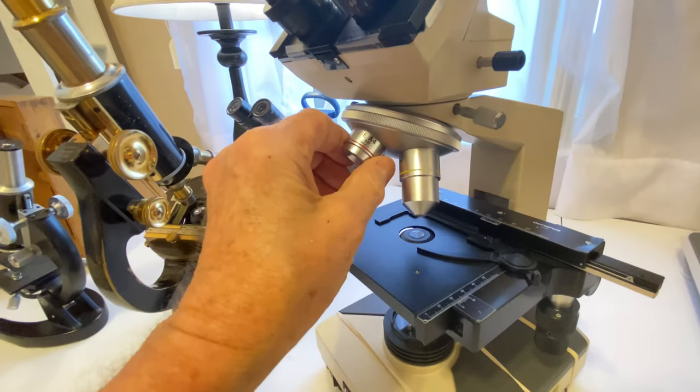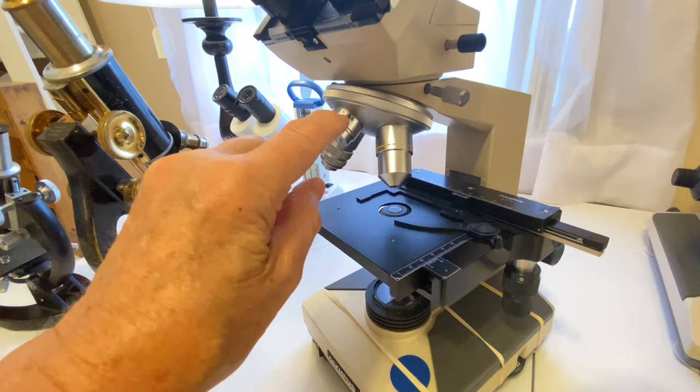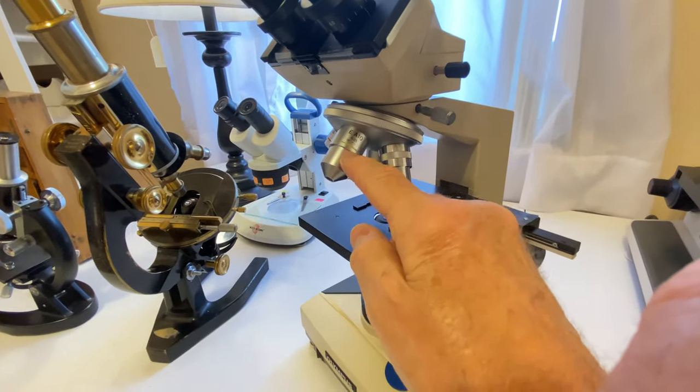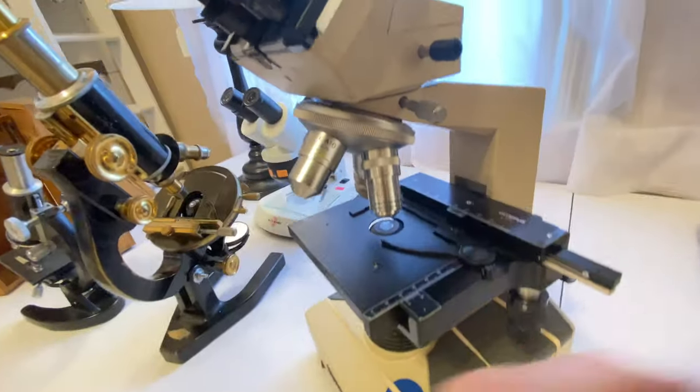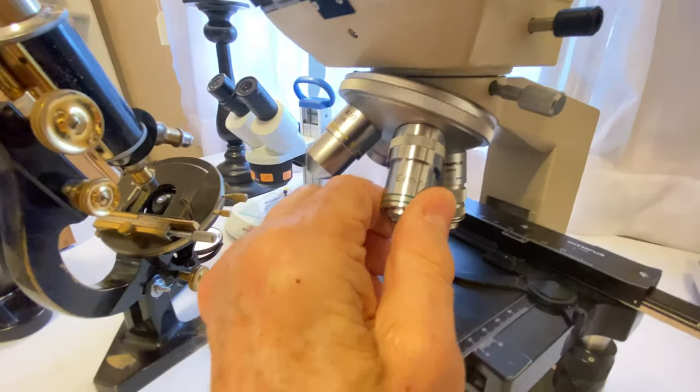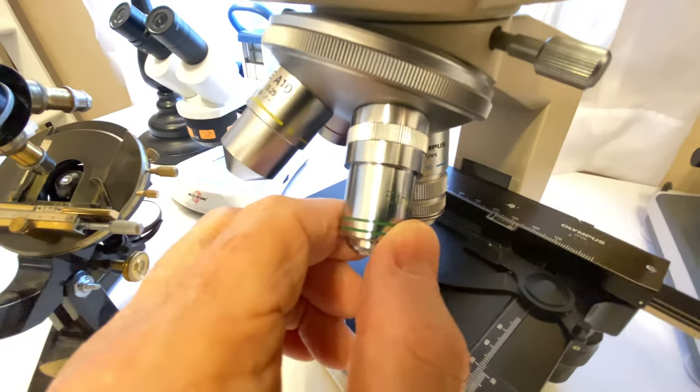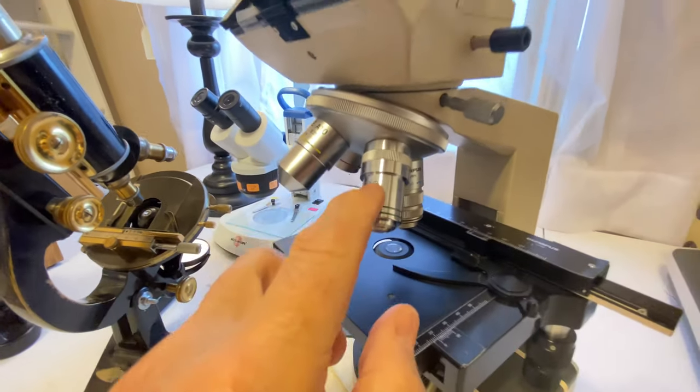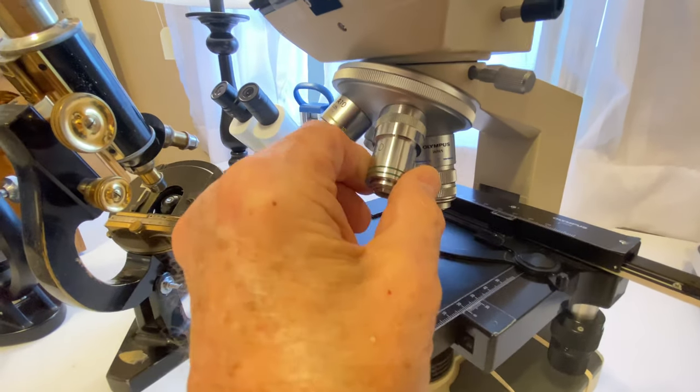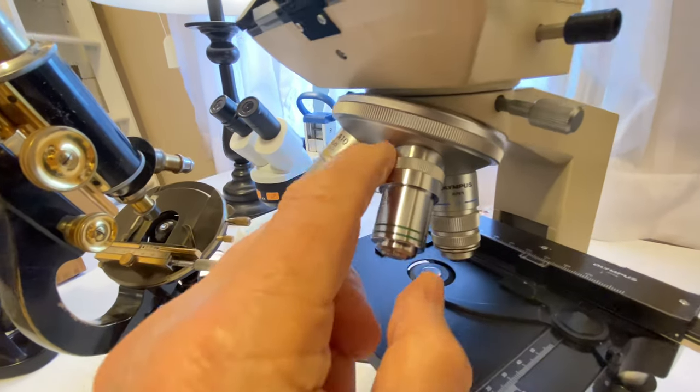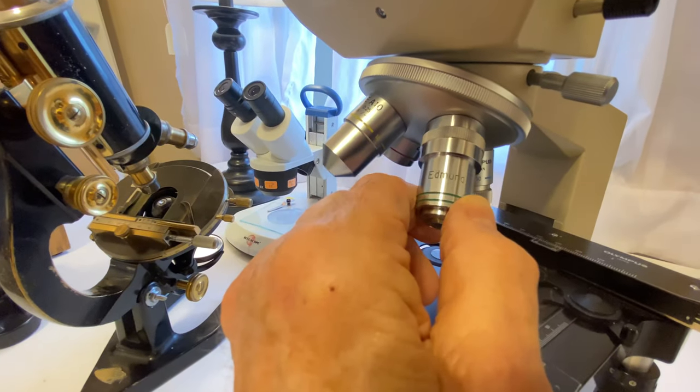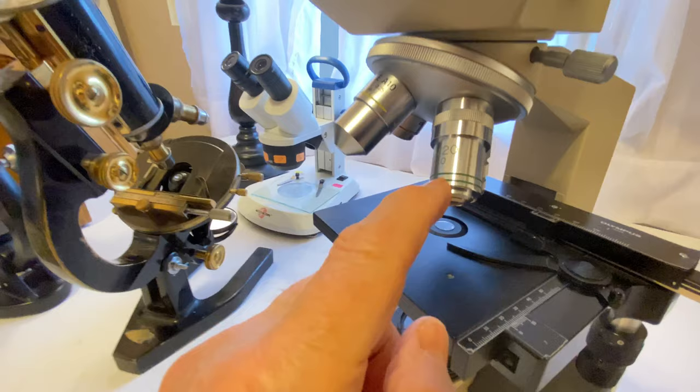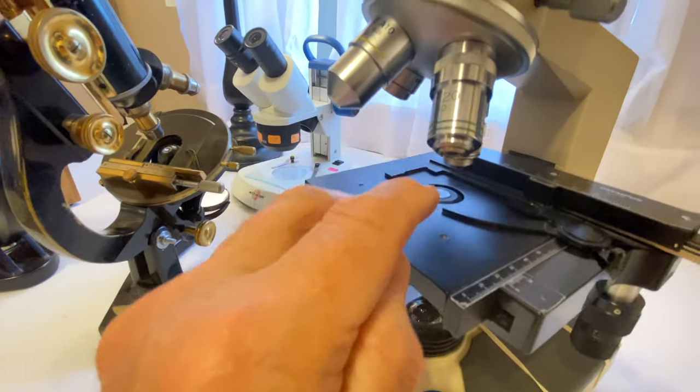So this one came with four objectives, the E series. Then we have the 10 power E series. Then I have a very interesting objective here. This one is by Edmund, 20 power Edmund. So I looked up Edmund, and Edmund objectives are very expensive, in the hundreds and maybe even thousands of dollars. I know this isn't part of that series. Maybe it's not even by the same company. But this was a very inexpensive 20 power. But what surprised me about this is the high optical quality, which actually surprised me. I decided to keep it.